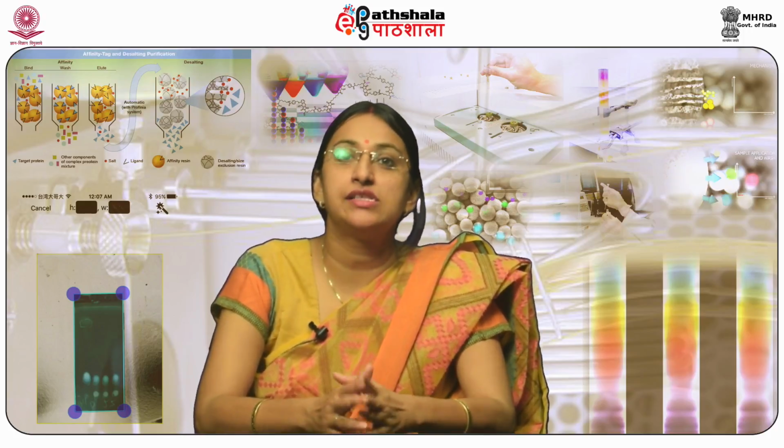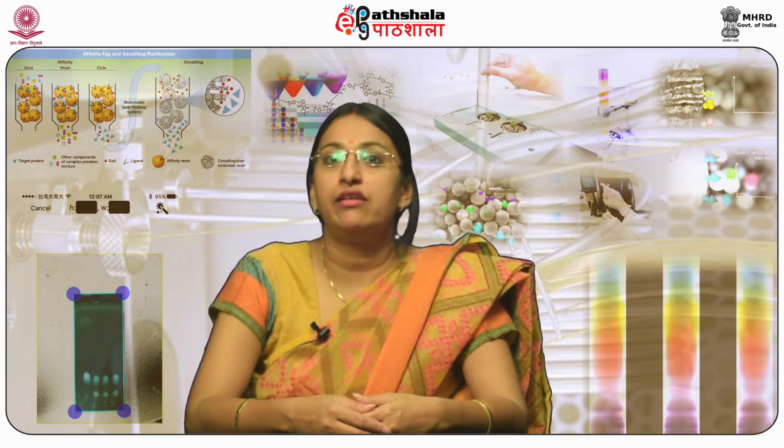For chromatographic separation and analysis of ionizable compounds, buffers and ion pairing reagents are added in the aqueous phase to increase retention. In ion exchange chromatography, aqueous salt solutions or buffers are used as mobile phase. Desorption of analyte molecules takes place by increasing the salt concentration in a gradient manner or altering the pH. Since the solute molecules carry charge and reversibly bind to the stationary phase by displacing the counter ions, they are eluted in the order of their strength of binding. The most weakly bound substance elutes out first and vice versa.